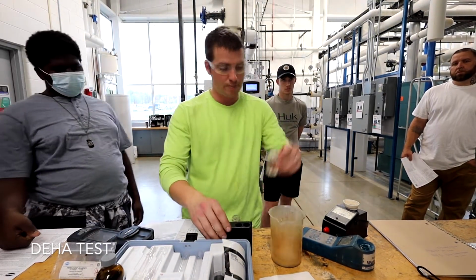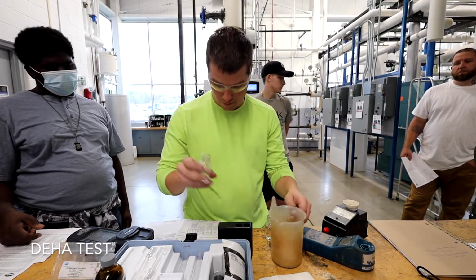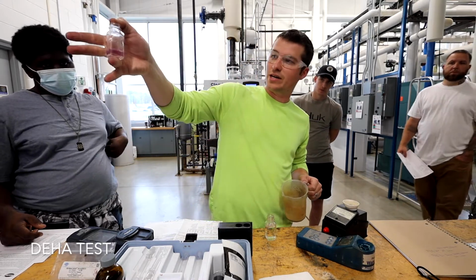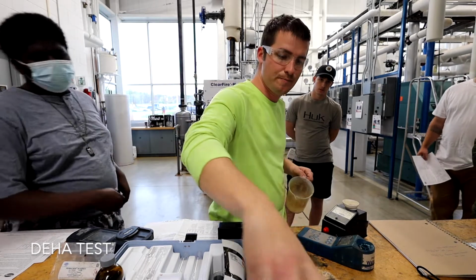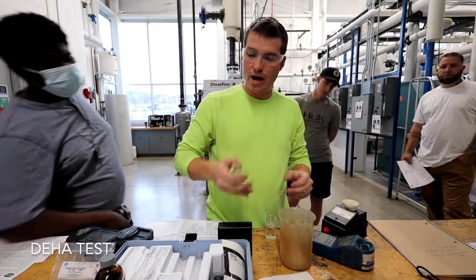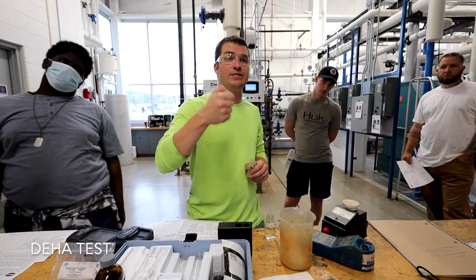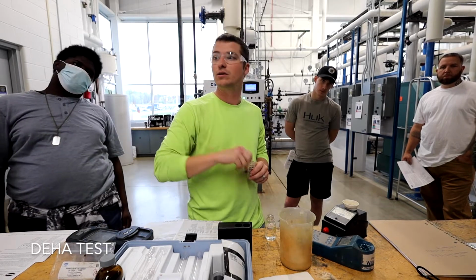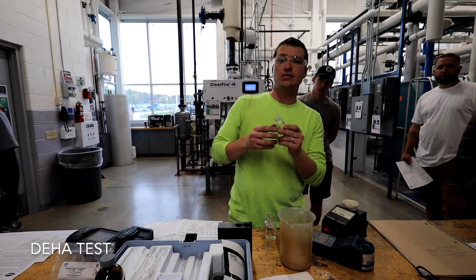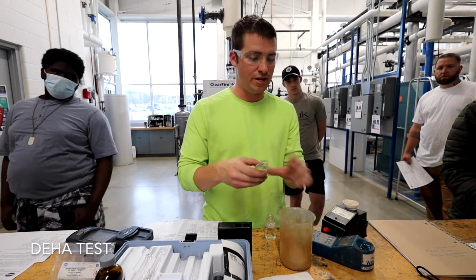All right, so we fill that up to the 25 milliliter line, that's our sample. Now I'll do it again with this one, and this is going to be our blank. Again, we want to rinse it out a couple of times. See how it wasn't properly rinsed, so it turned purple right away. When you're done, ideally you would go to the store and buy a gallon jug of distilled or deionized water, or demineralized, that's the same thing. When you're done with this test, you would rinse this out with that, so we don't leave any residue behind.